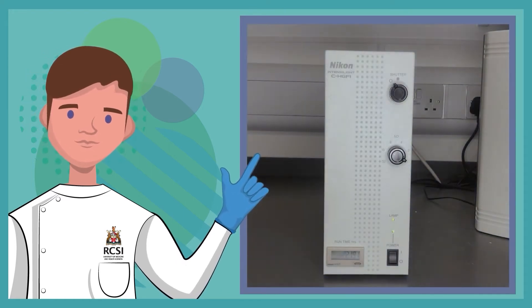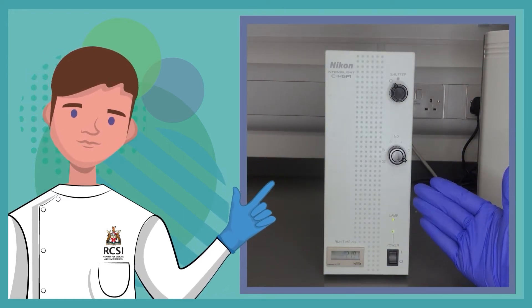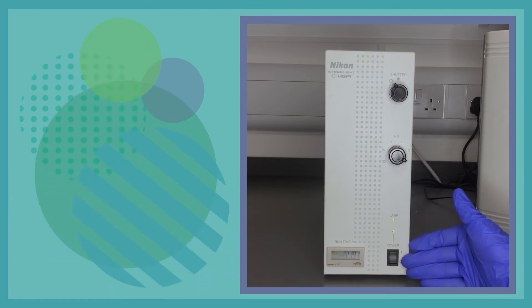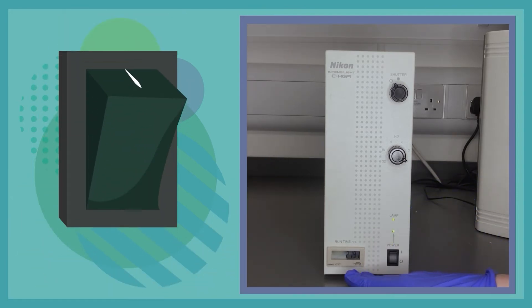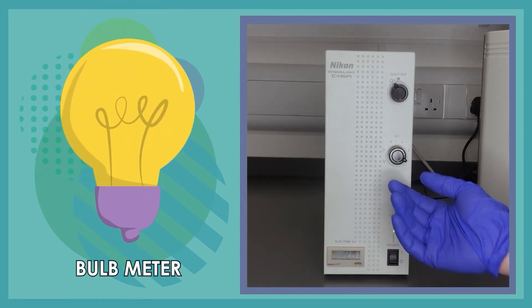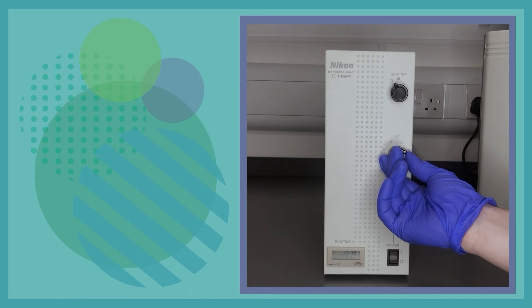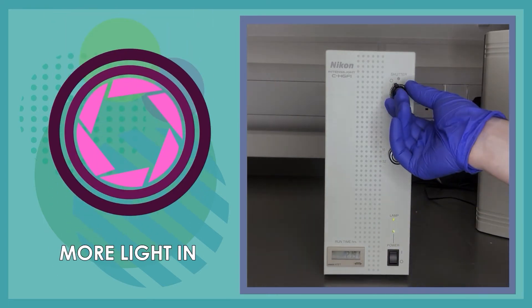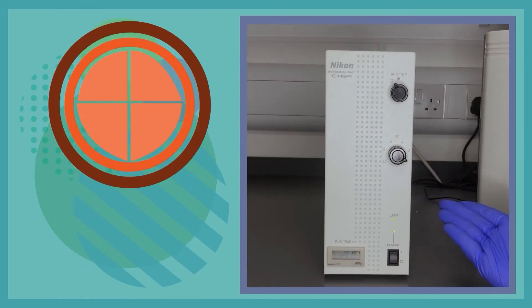So first we'll look at a light box for the microscope. There are different controls we need to know. First, the power switch which turns it on. This is the bulb meter which indicates the lifespan in hours of the bulb. This knob allows us to adjust the amount of light passed through the filter, and this allows us to open and close the shutter.